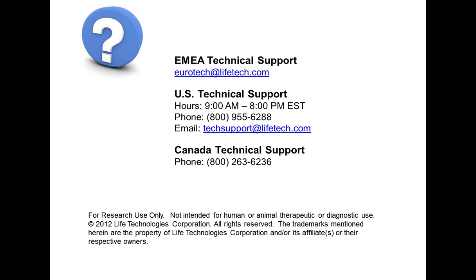So there's a question about compatibility between different dyes and cell types. And I'm not sure exactly what that means, but my suggestion is that you do optimize your experiment to your cell type and the different dyes that you are using for that.